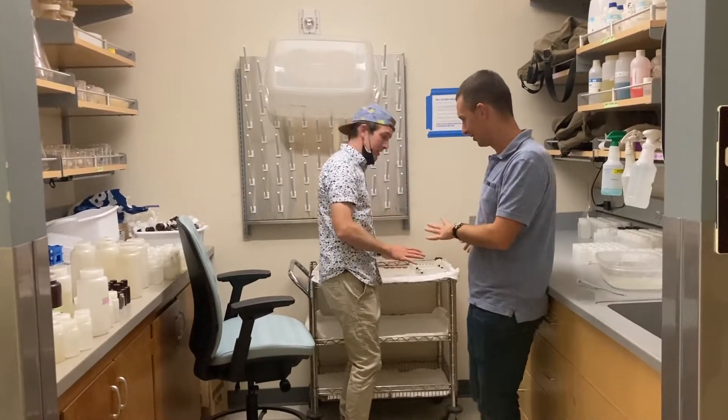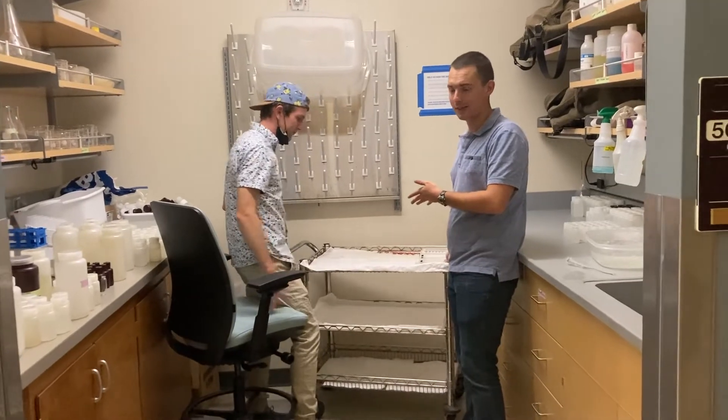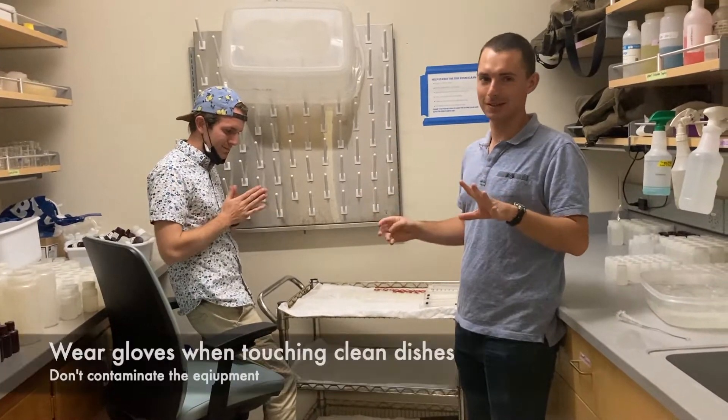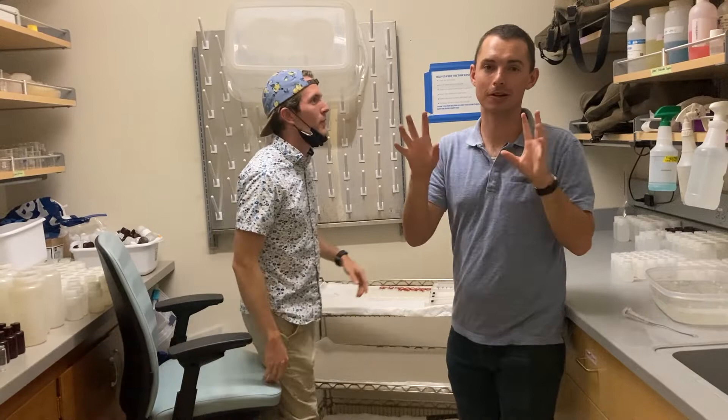Hey, whoa, Nick, what are you doing? I'm just cleaning the dishes. This is a drying rack for clean things. No — hands are always dirty. We want to make sure we keep our clean things clean, not dirtying them with our gross fingers.